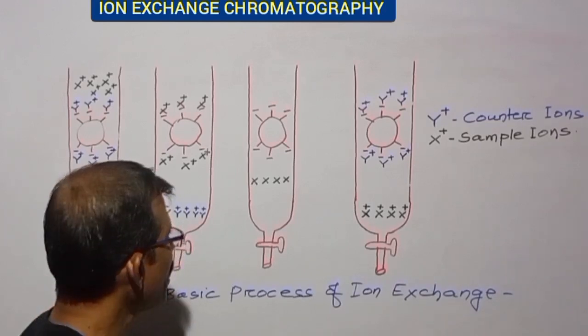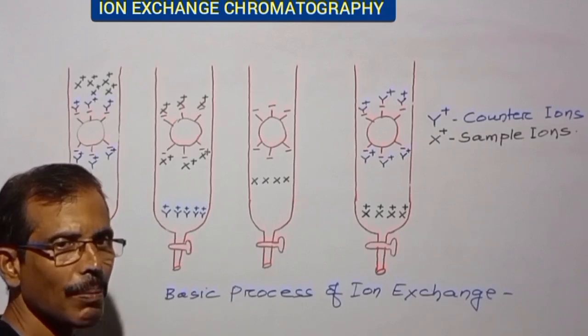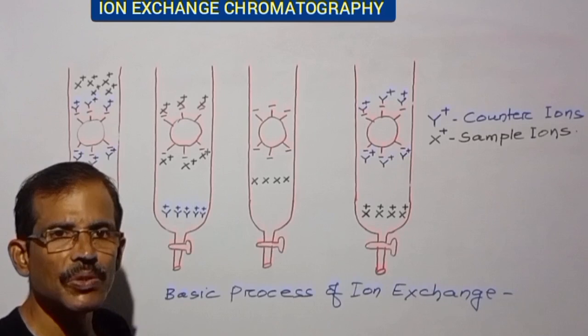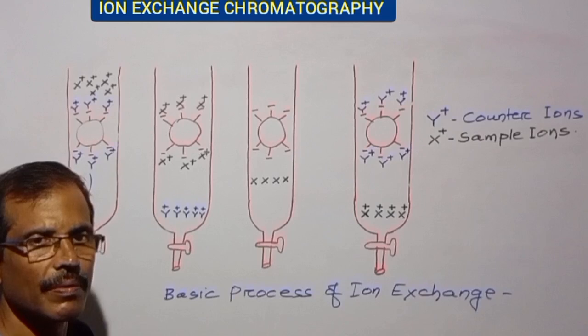So in this way, different types of positively charged compounds can be separated from a mixture. For separation of negatively charged compounds, anion exchange chromatography will be useful.